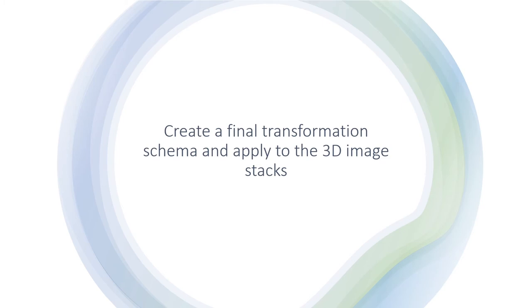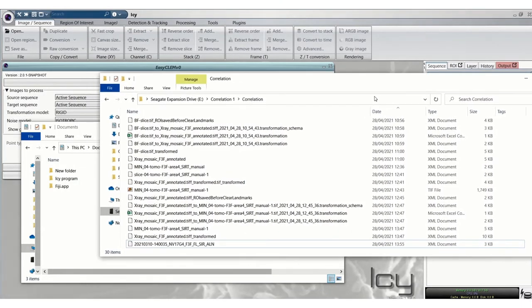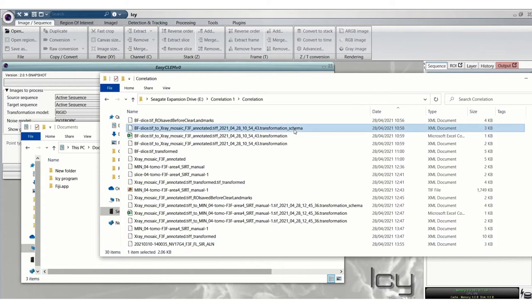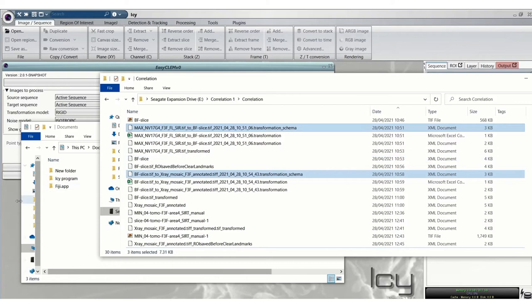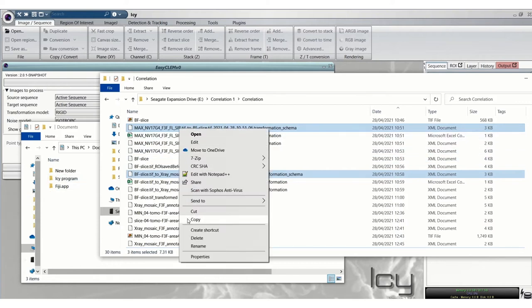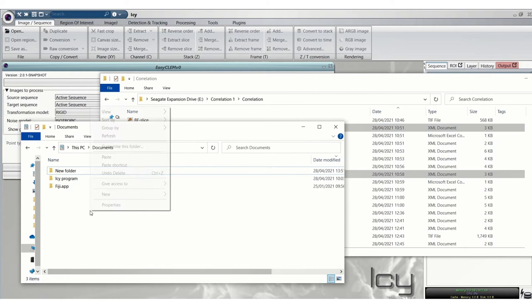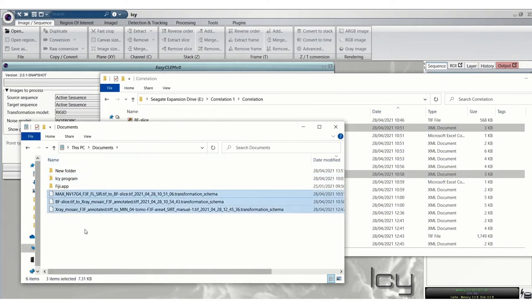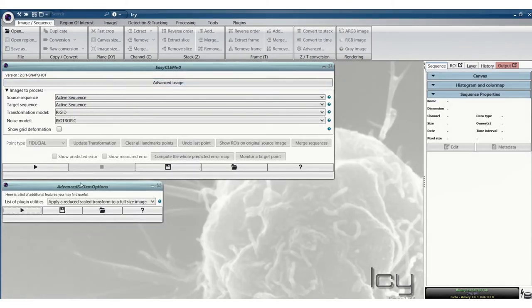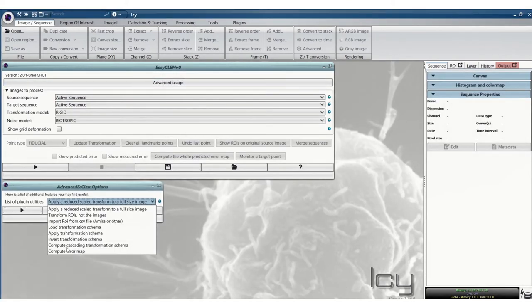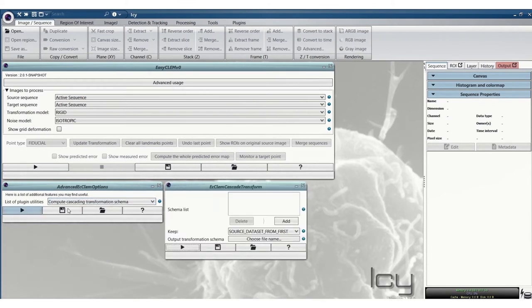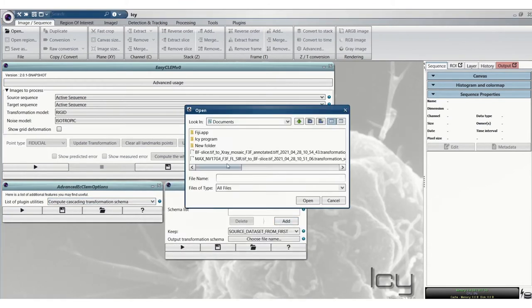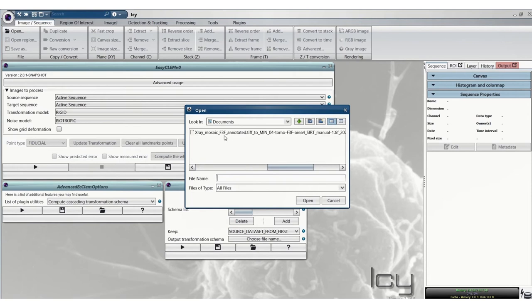So now we'll use the transformation schema files that have been saved already from these transformations that we've done to create a new transformation schema file. So you take the ones that have underscore transformation schema on them, there's actually three XML files that are generated, as you can see. I'm placing them here into the Documents folder so it's easy to find them. If you go to Advanced Usage in EC Clem and go to Compute Cascading Transformation Schema, you add the files in the same order that we've done them, so Sim to Brightfield, Brightfield to Mosaic, and finally Mosaic to Tomo.